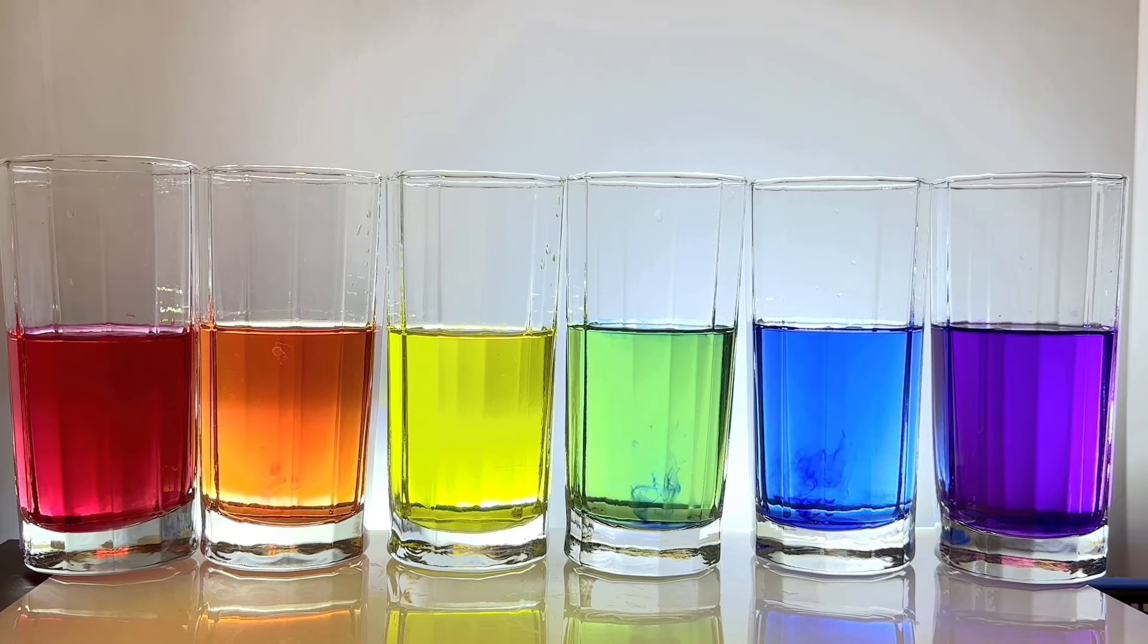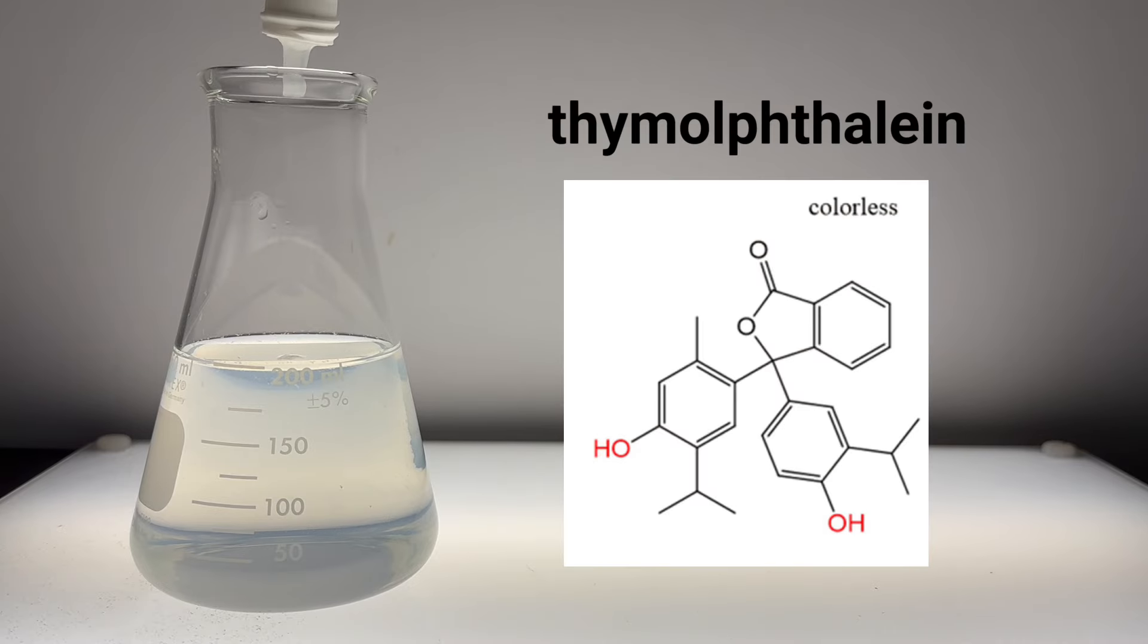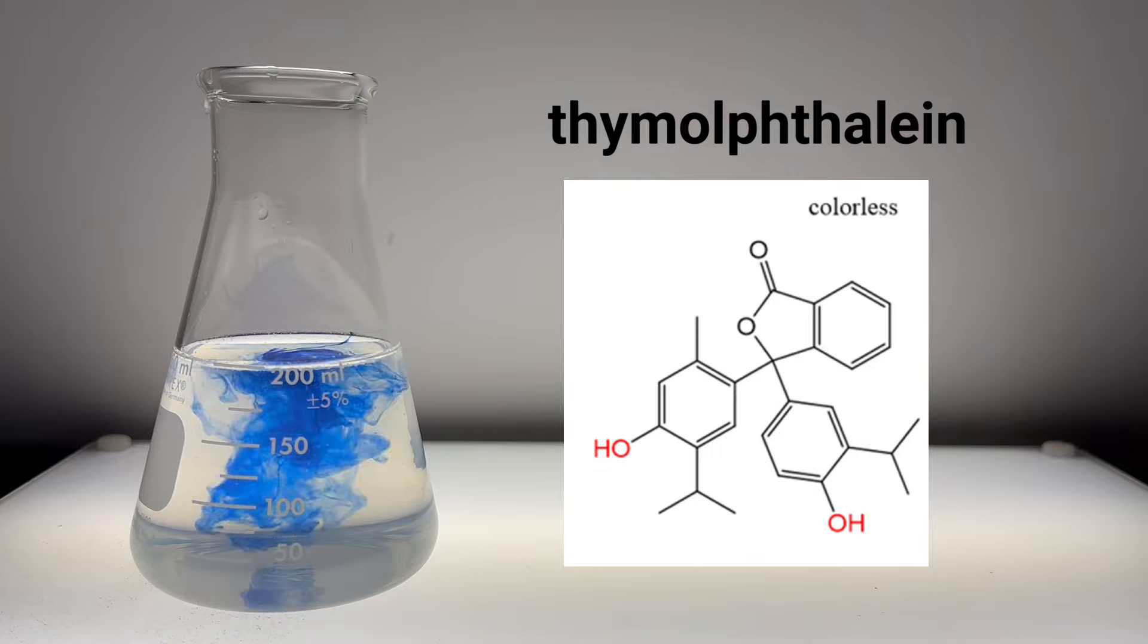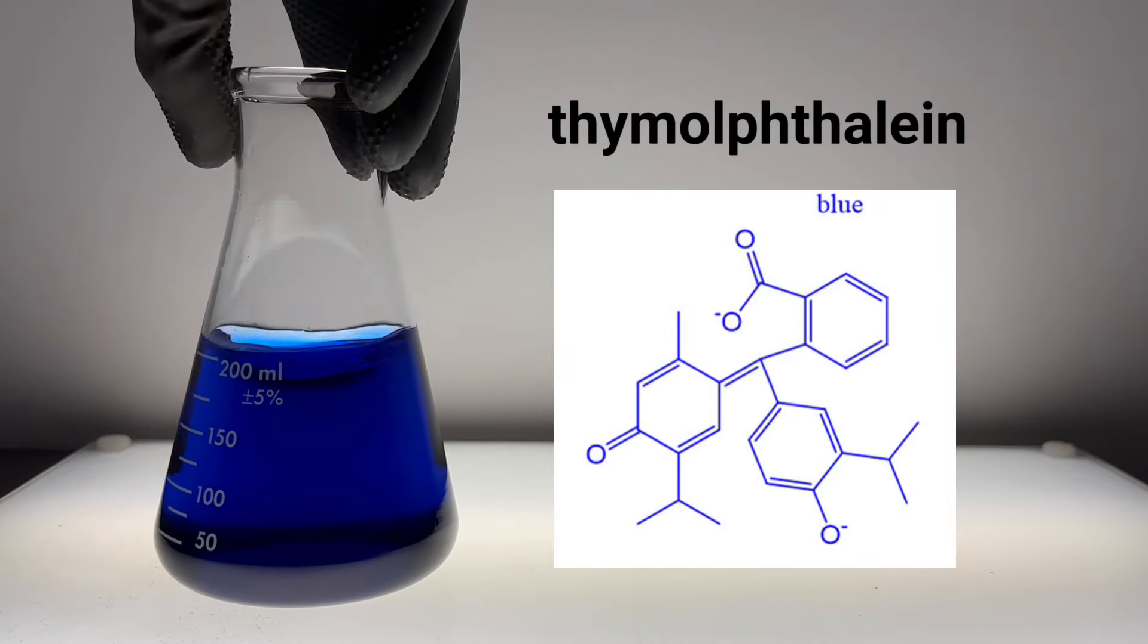To show you how to generate the blue color, I'm going to add some base to this flask that contains a chemical called thymolphthalein. In the presence of base, thymolphthalein molecules undergo a ring opening reaction, and this change in chemical structure causes a shift to a blue color.